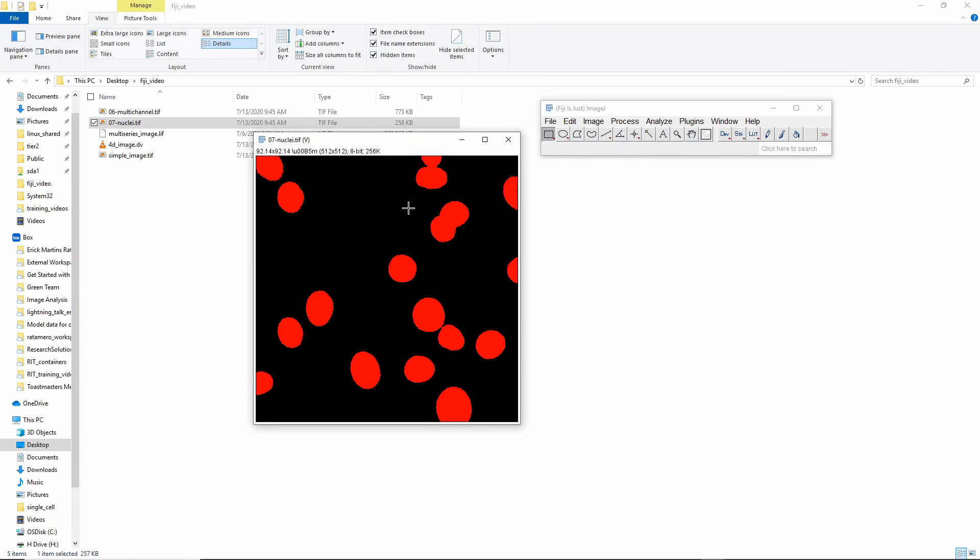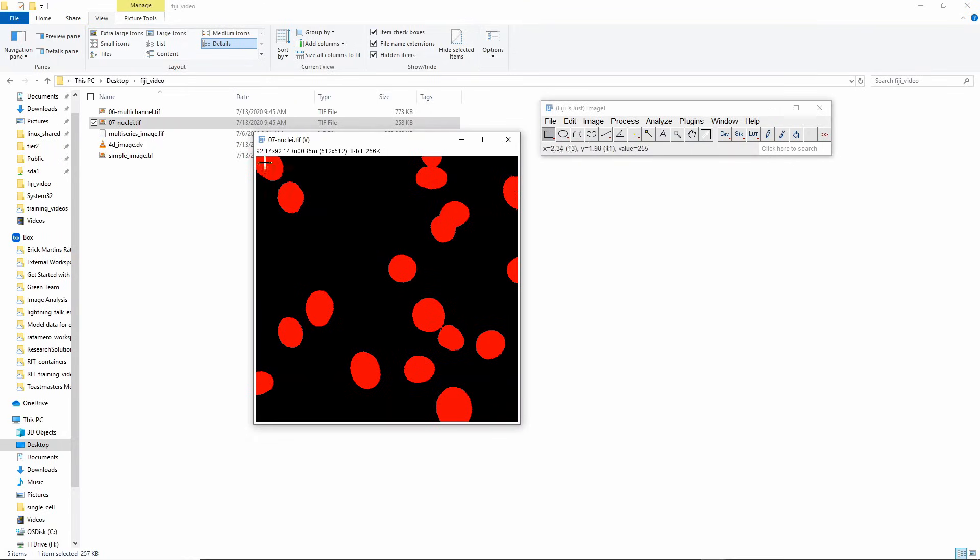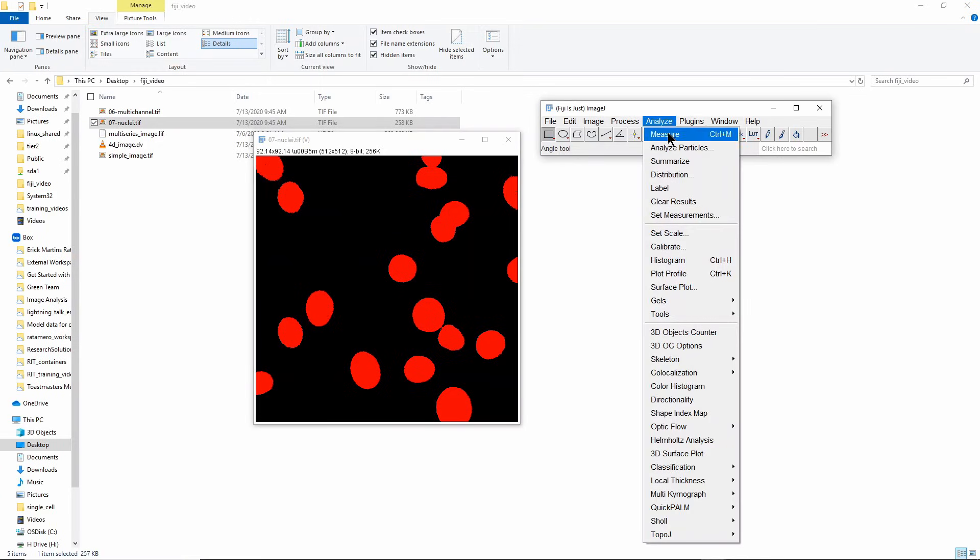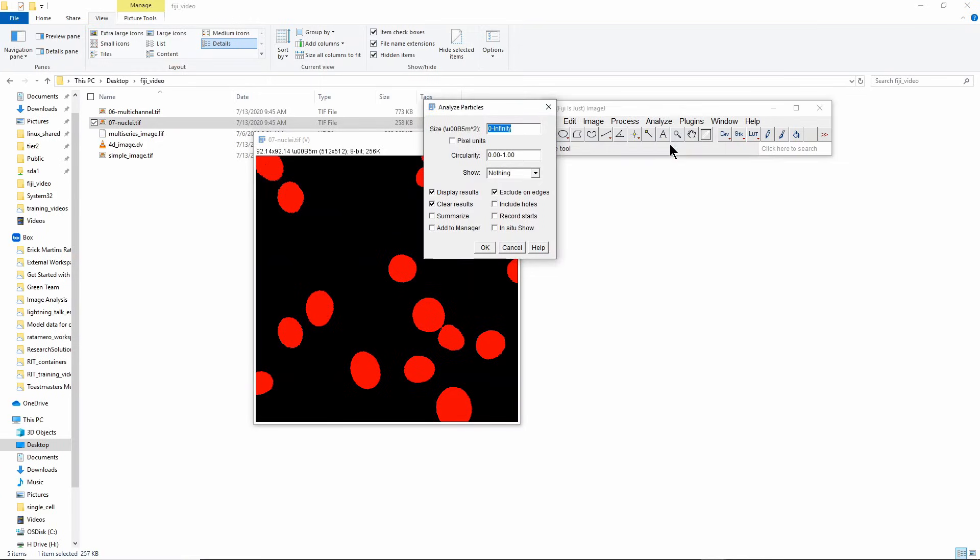I have only foreground and background now. The second part of segmentation is I need to do something called connected component analysis. Essentially what I'm going to do is go to each individual pixel and see which pixels around it are also foreground, and I'm going to grow these regions until I get individual objects. This is done in Fiji by going to Analyze > Analyze Particles.